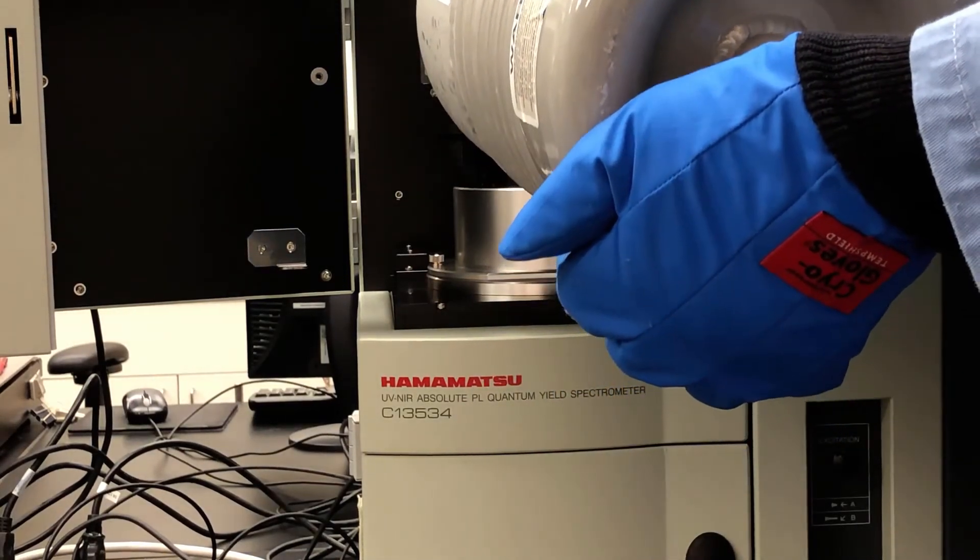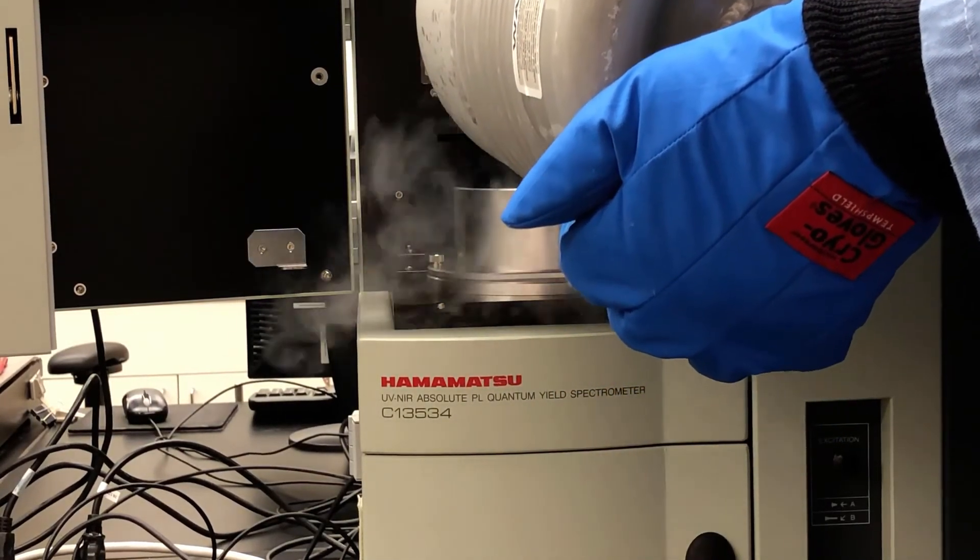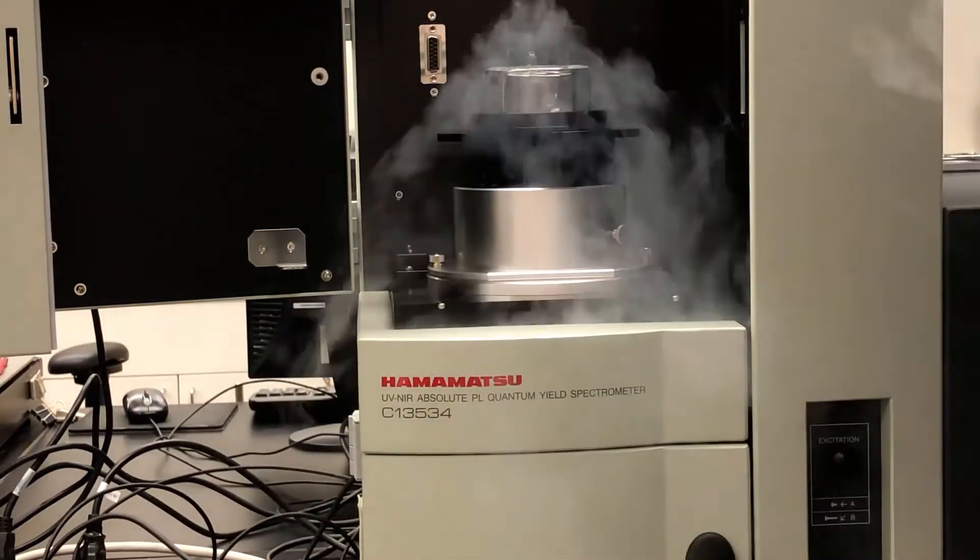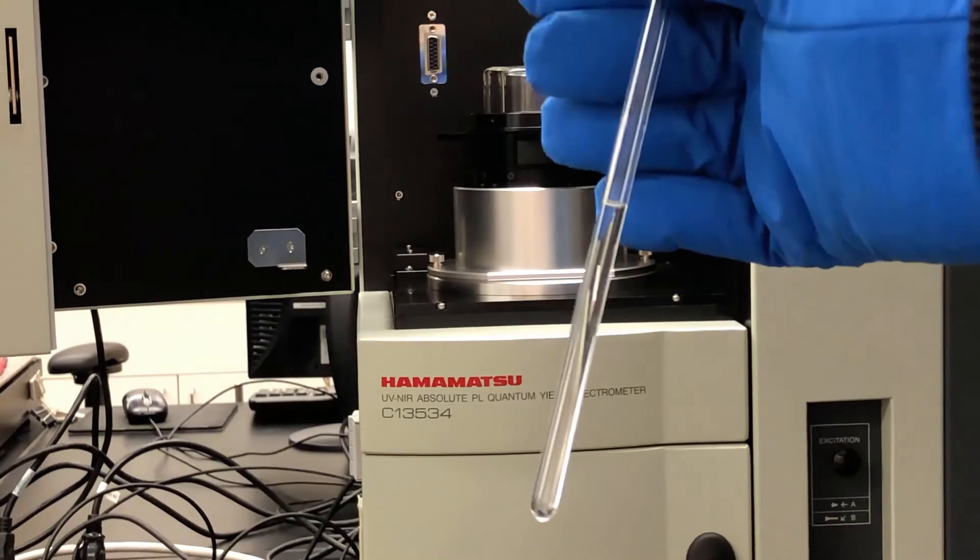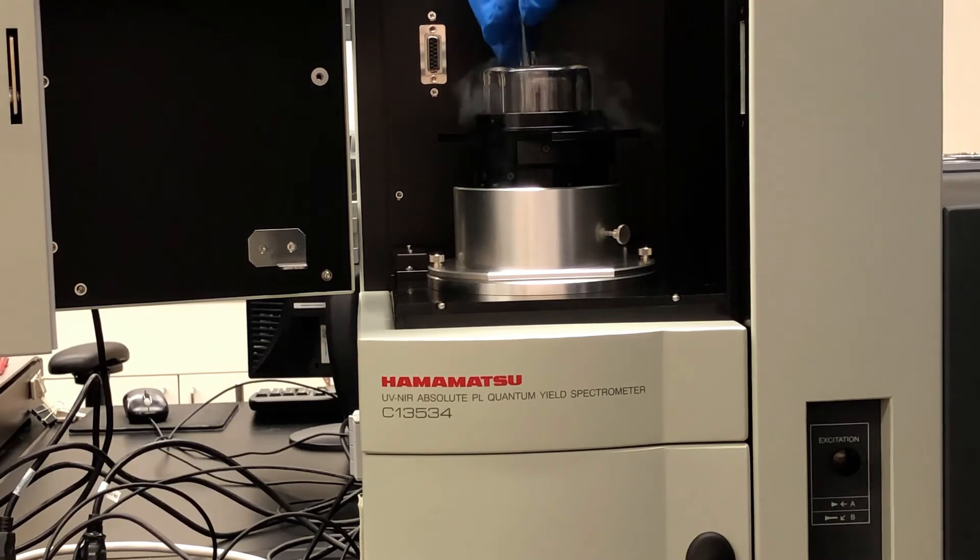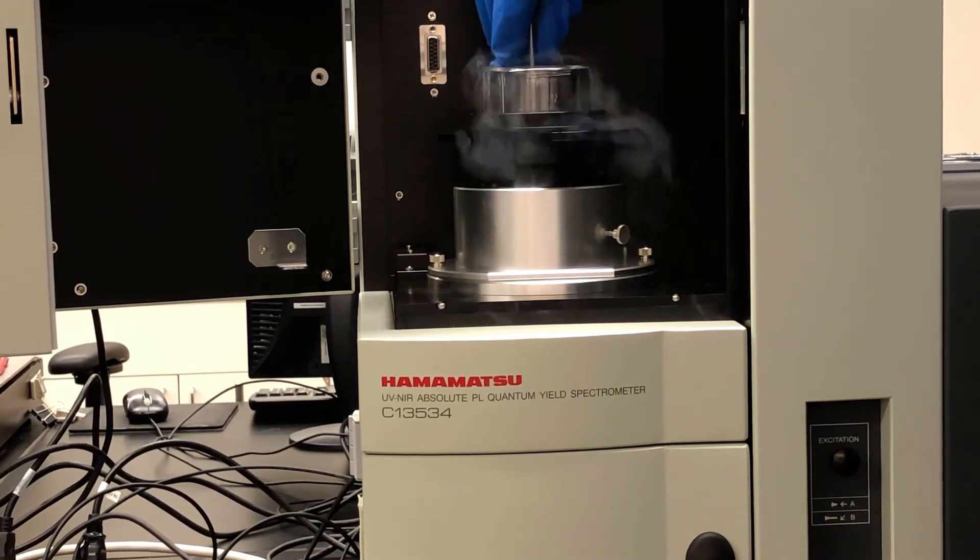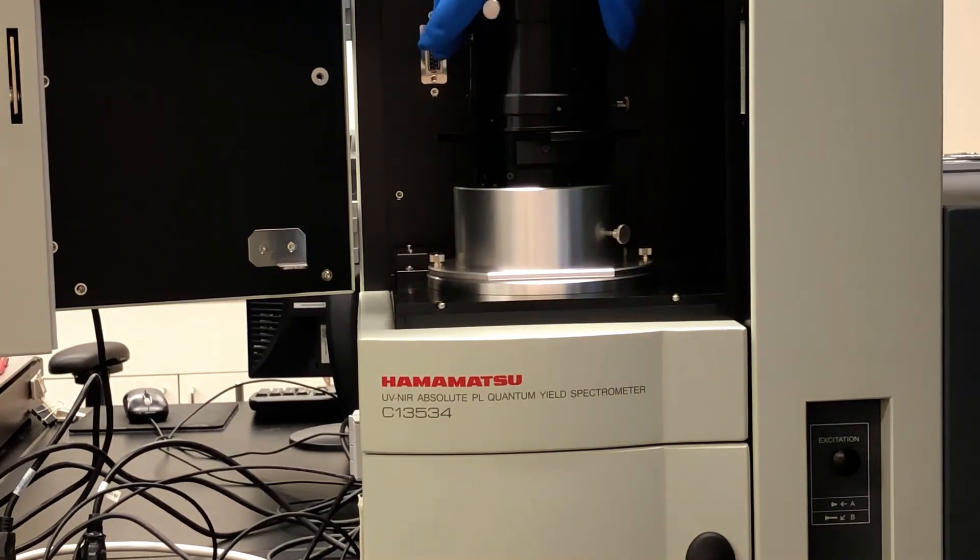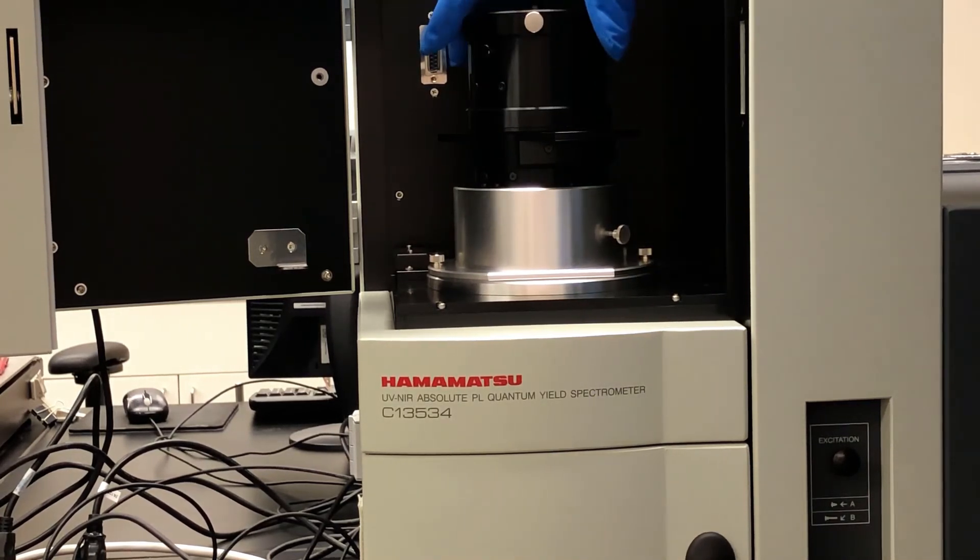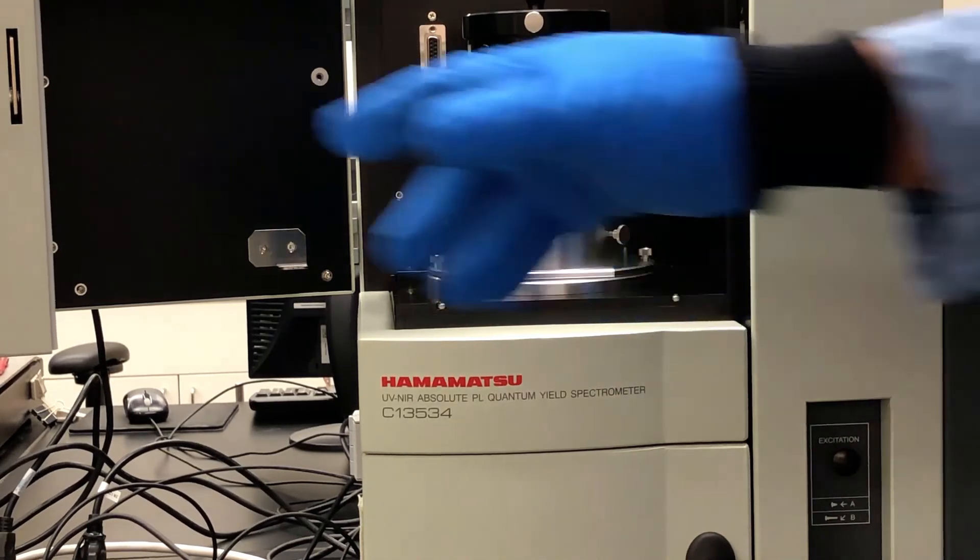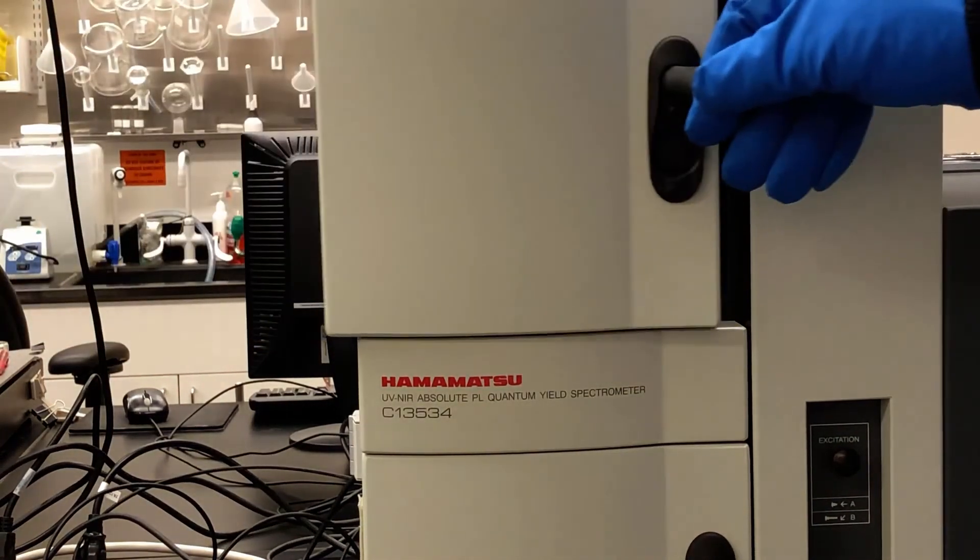When performing cryogenic measurements, solvents that vitrify at low temperature are recommended. We'll be using pure ethanol simply to demonstrate the loading procedure. Let's seal it with a cap to contain the liquid nitrogen. Then you can close the chamber and conduct your measurement.